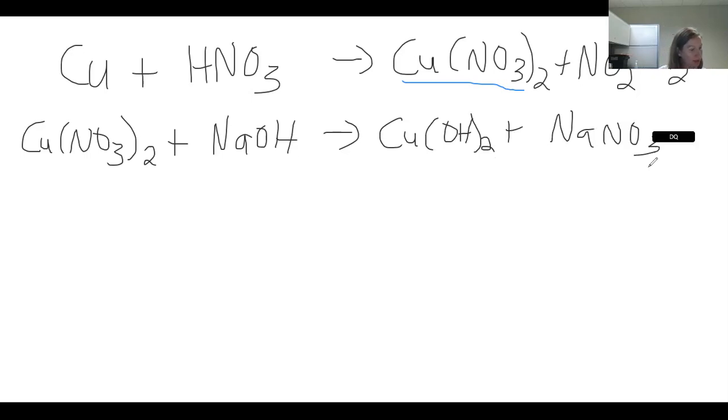And in the pre-lab, it wants you to write the balanced equations. Write balanced equations for each of these processes. So yes, I'm giving you the reactants and the products, but I'm not balancing it. So you're going to need to go back and add coefficients to balance each of these equations. They might even be given to you on later pages for you to double check your work.